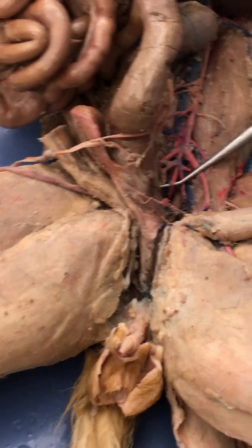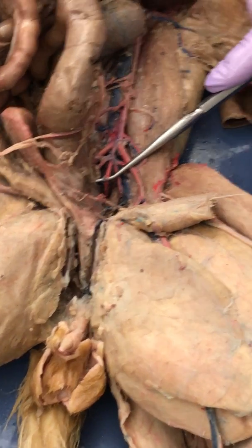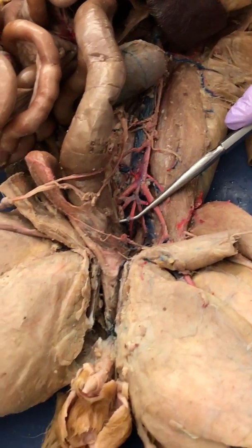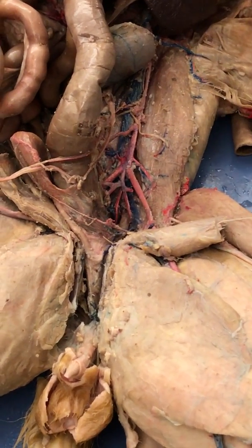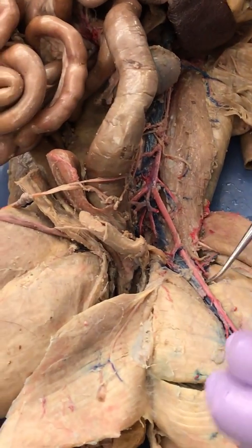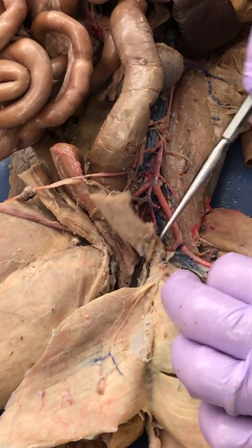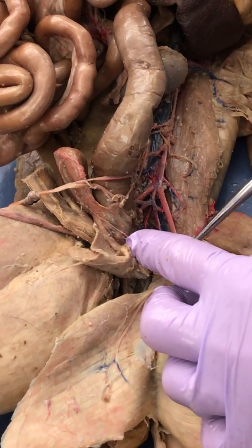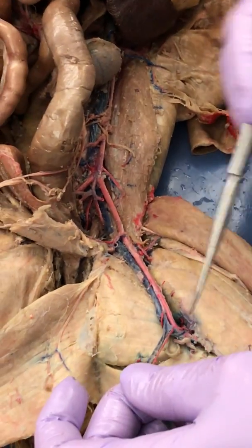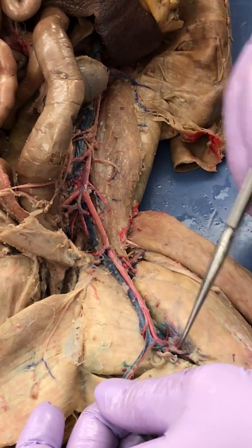Caudal. See, once you dig in there, it starts getting loose and it's easier to see stuff. You may remember your first day it was in there so tight. So now it's easy to see that. Okay, so then the external iliac goes into the leg. So now we call it the femoral. And what about this one? Deep femoral. And then I'm going to pull and it disappears. There's a nice view. Look how big it is. See that?